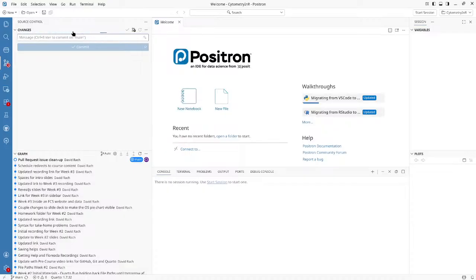And as you can see, it's going to GitHub. It's pulling in data, and it's going to take a little bit just because the last update was February 22nd. That's been quite a few weeks with quite a few FCS files, so let's just give this a couple minutes to be able to proceed.